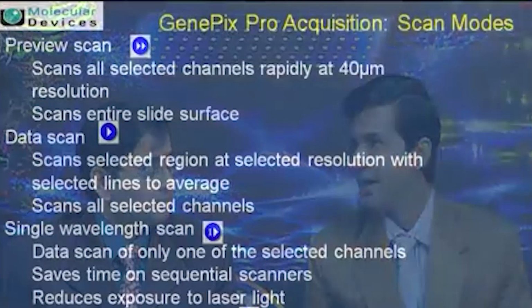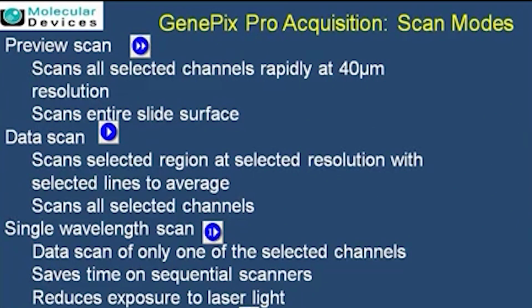True. So the basic GUI which we are going to see in a few minutes actually contains three different areas. The first one is image laser controls, where you see which kind of laser I am going to use. The second one is the different features used for controlling the image, and towards the right hand side we have a pane which is helpful in hardware controls.